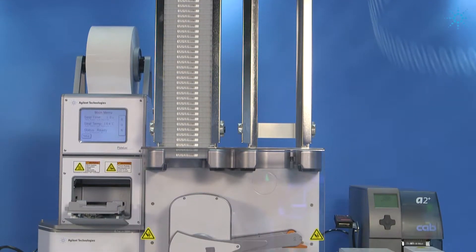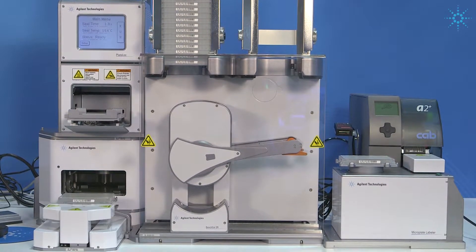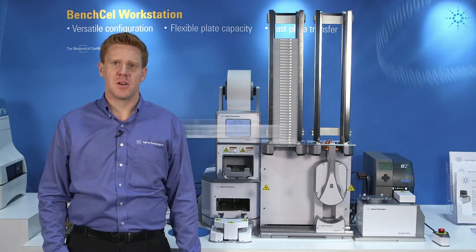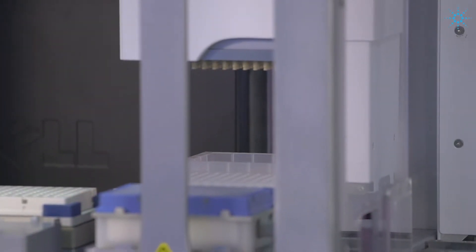Today's researchers are looking for an automated solution that can handle many workflows without becoming an automation expert. Many of these workflows include microplate solutions such as plate labeling, barcode labeling, and even high throughput screening. The Bench Cell Workstation provides you with a compact footprint to give you a lot of versatility with your applications, but being able to do it in a high throughput manner.